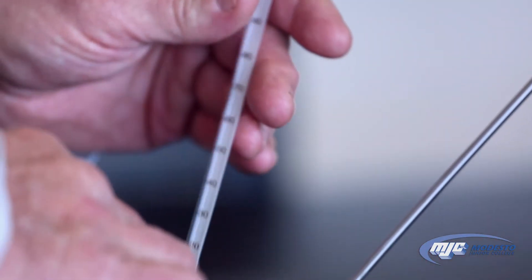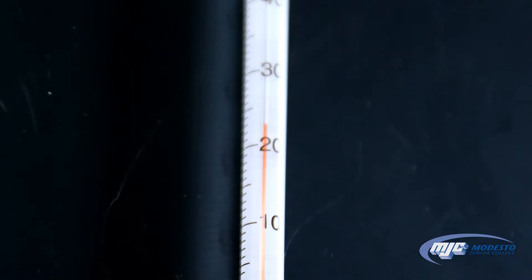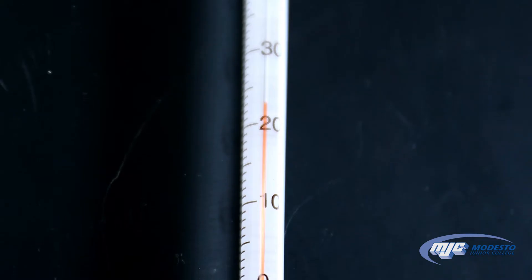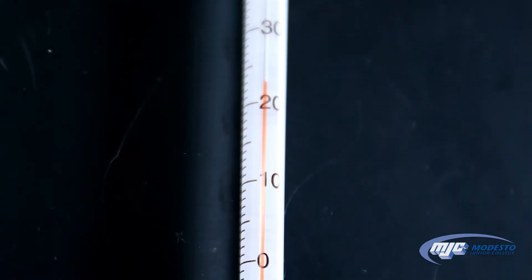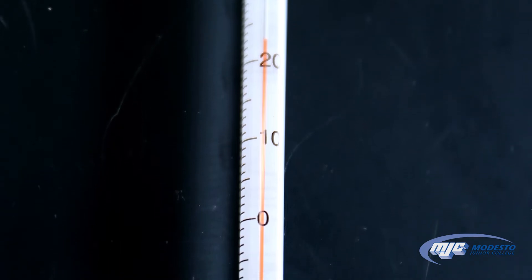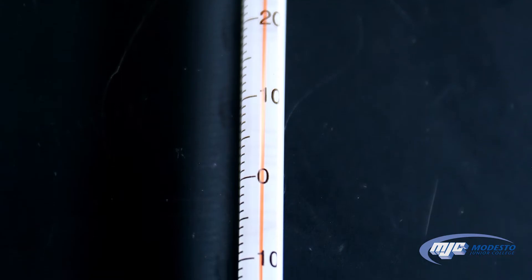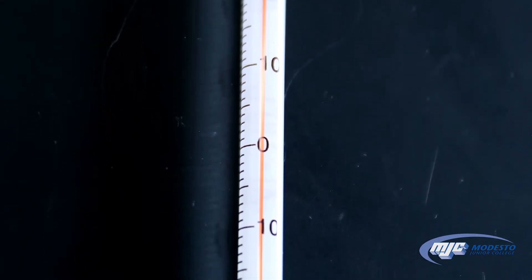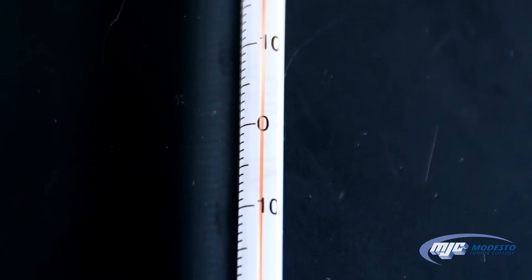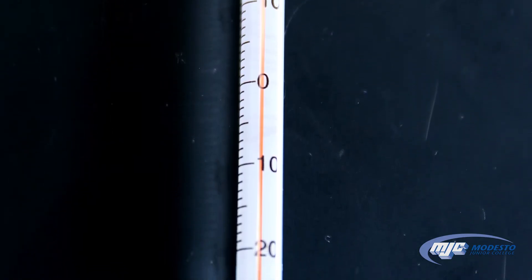To read the glass thermometer, we just read the top of the red line. An important thing to know is that the closest marks on these thermometers are one degree Celsius apart, which means we will record any measurement we take with this thermometer one place to the right of the decimal — to the tenth place — even if it's a zero. If it's right on ten, we would record 10.0 degrees Celsius.